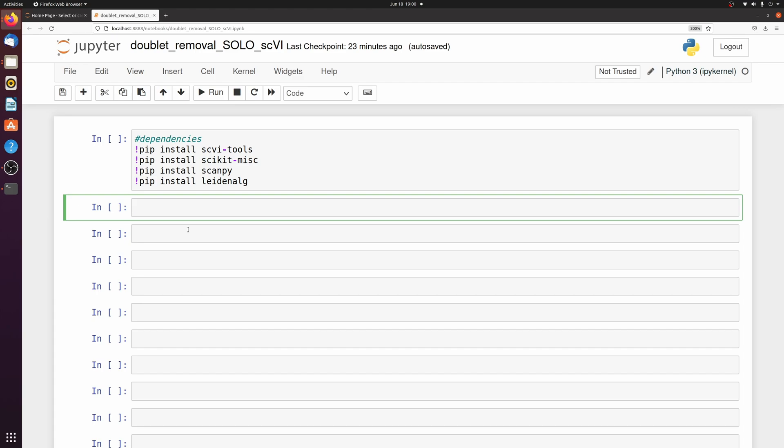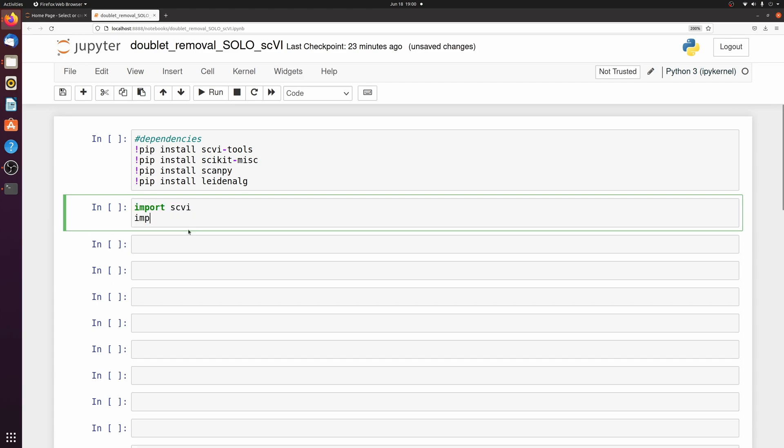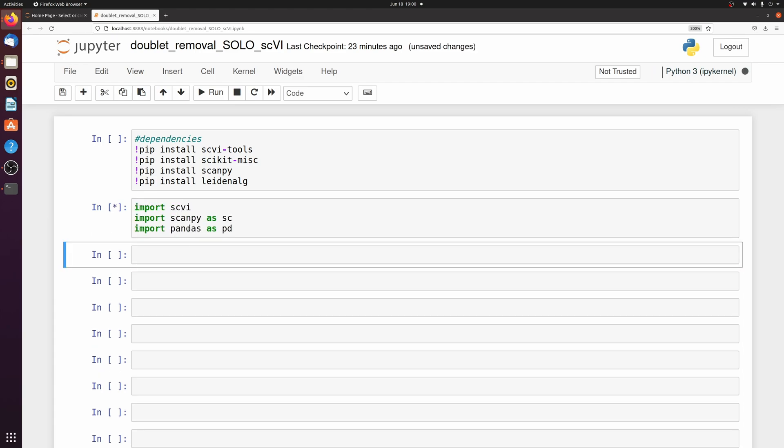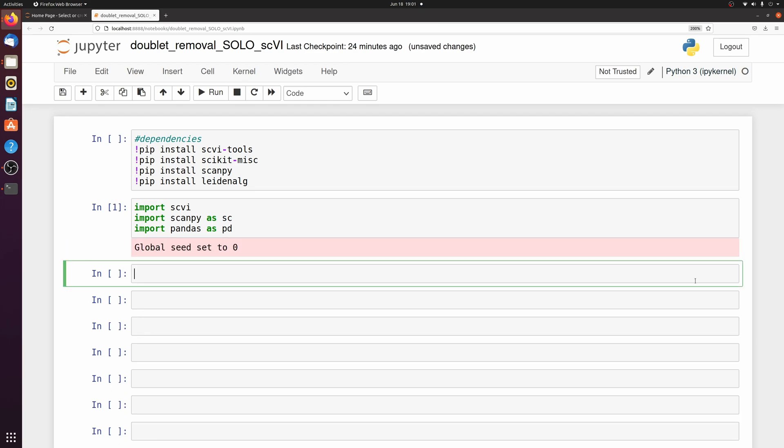We're going to start by loading in scvi, scanpy, and pandas. And then we're just going to load in our single cell data as adata. It doesn't matter the source, I'm just loading in a 10x h5 file.